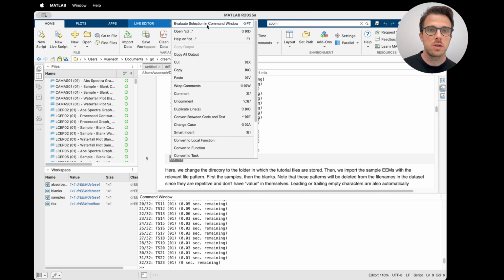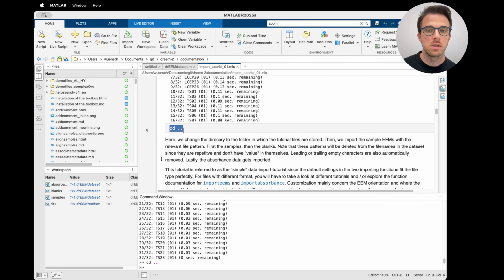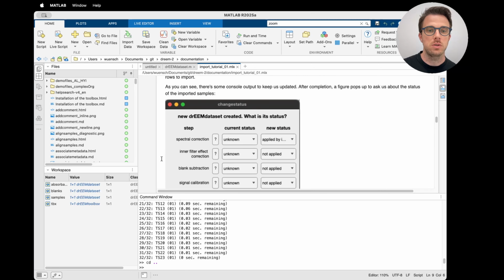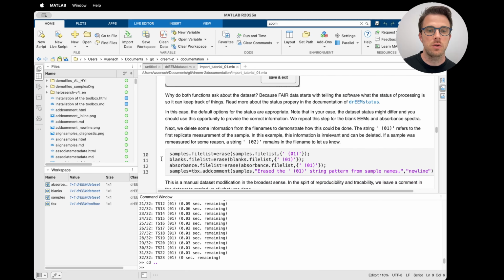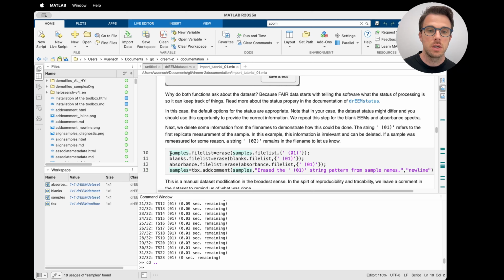Then we change the directory back to the parent directory so that we're back to where we belonged. So I'm scrolling over this just to demonstrate that actually there was a spelling mistake in one of the samples. And some other things that are particular to the Aqualog can be fixed now.